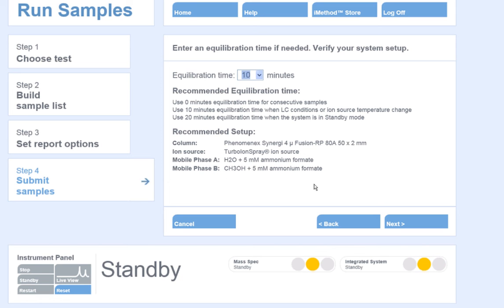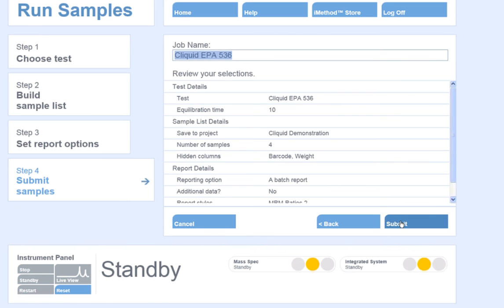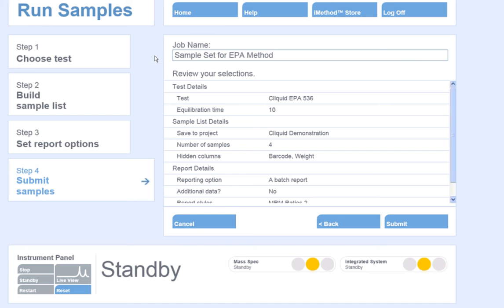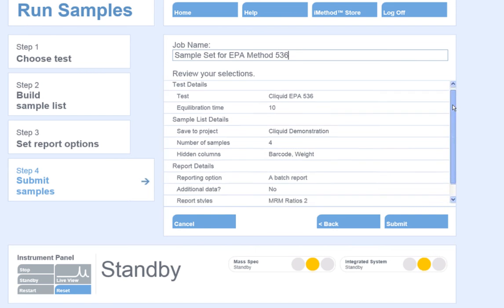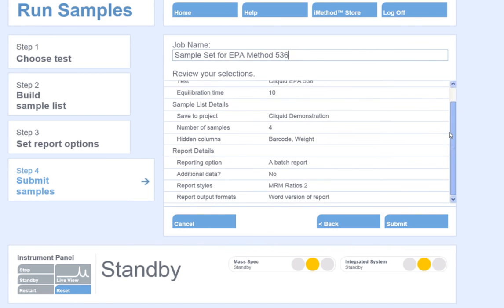The final step is to give the job a name. I will call this job Sample Set for EPA Method 536. I can also use this screen to review all of the options I selected as I built my sample batch.